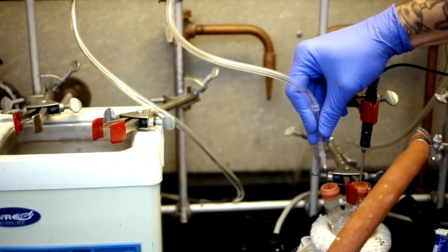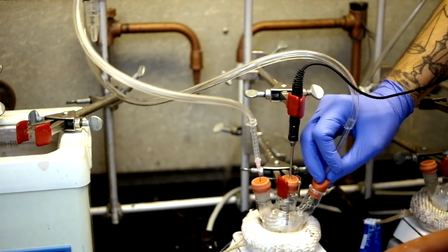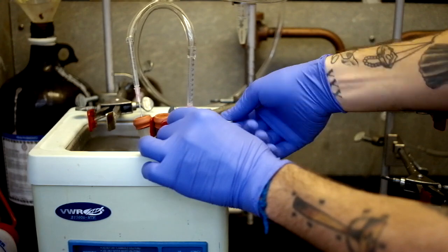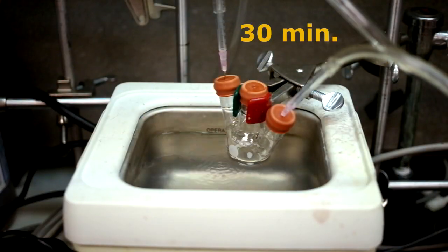After the selenium flask has been degassed for one hour, you can switch to argon and remove it from the heat. You can also remove the temperature probe and place it into the sonicator to dissolve the selenium powder. It should sonicate for about 30 minutes.